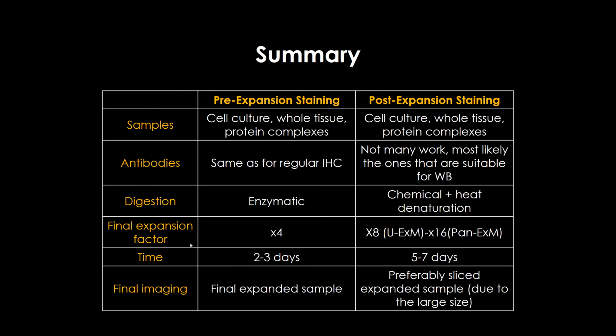So just to summarize, I told you about pre-expansion staining versus post-expansion staining techniques. The samples can be pretty much everything that you can think of. Sometimes it can be applied even to some proteins or protein complexes in solution, as well as cell culture, whole tissue, everything that you can think of.